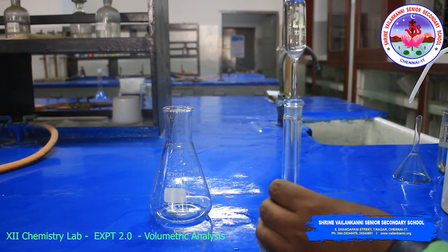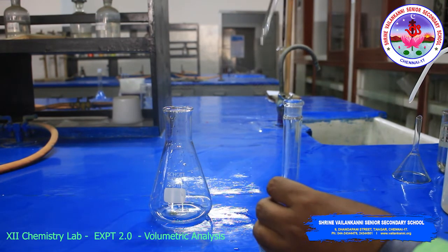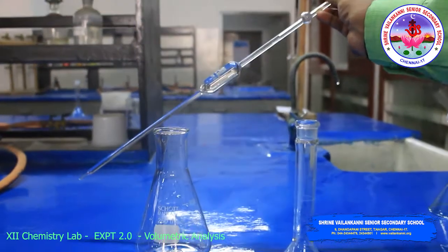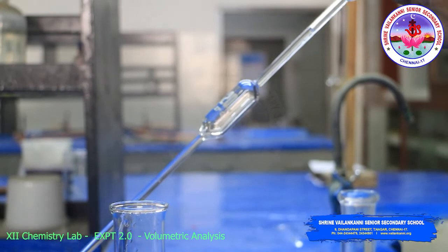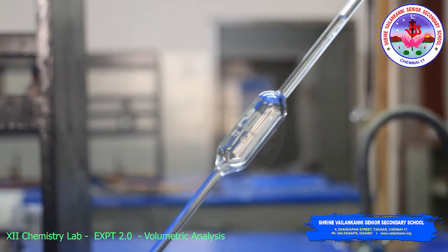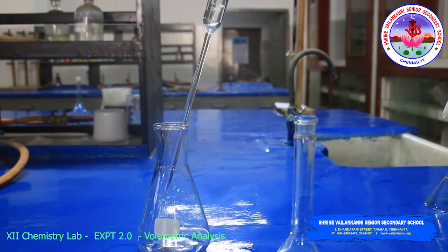Here also the measurement is very exact. See, this 20 ml pipette solution, that is oxalic acid solution. The mark, look at this mark, up to this mark 20 ml. So we have to transfer this solution to the titration flask.